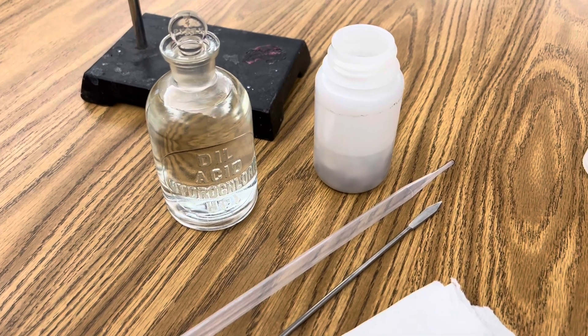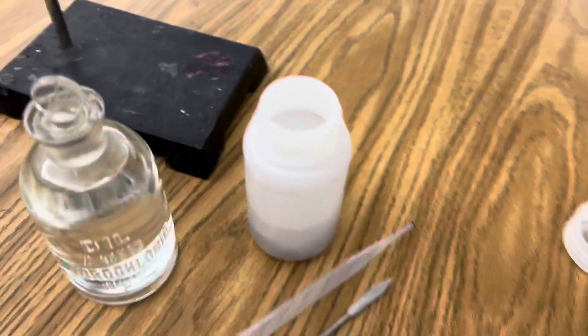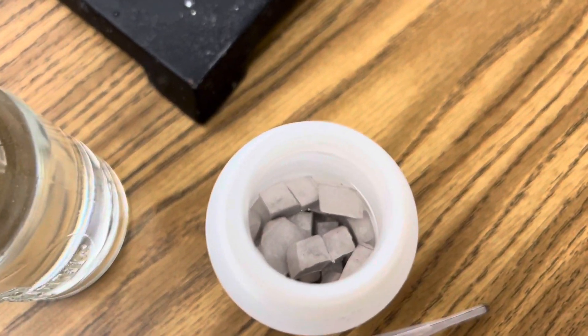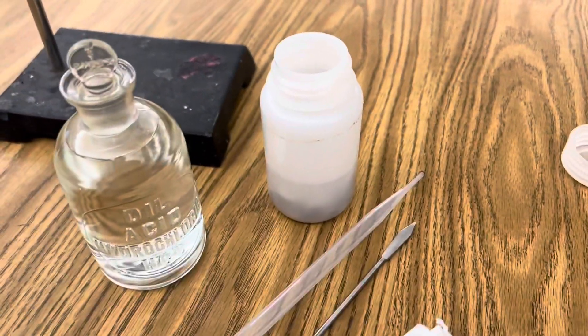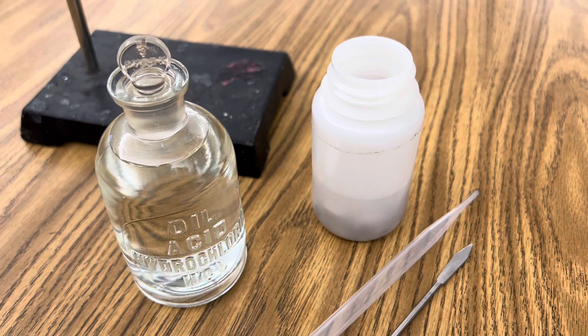All you need for this reaction, of course, is hydrochloric acid and sodium that I like to keep stored in mineral oil, a dropper, and a fairly long test tube to contain the reaction — as you're going to produce the salt, sodium chloride, and hydrogen gas.